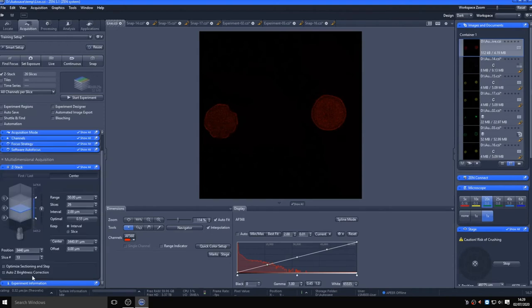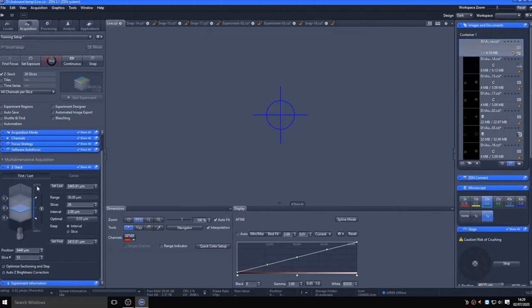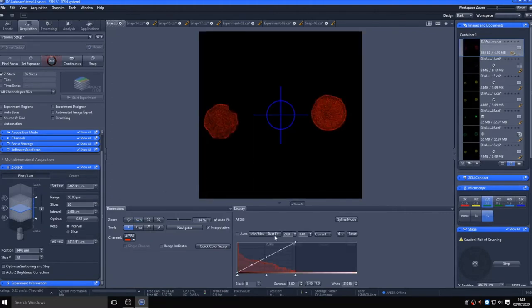I can set the positions manually by going live and focusing through the image from top to bottom, and setting the start and end points of the stack. This is often the easiest mode to set up for single images, whereas using center mode is best if you wanted to use multi-position imaging too.